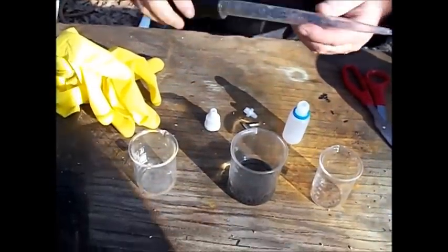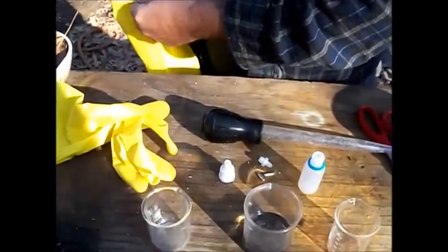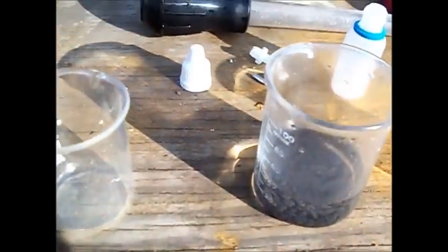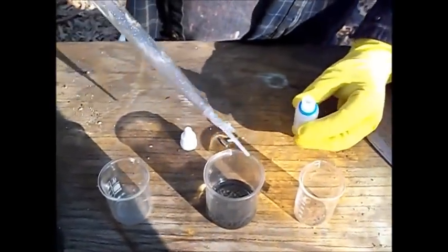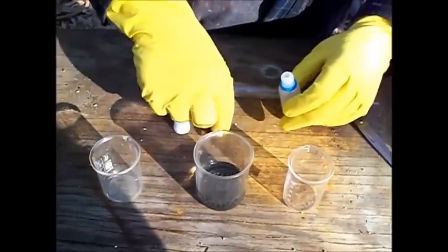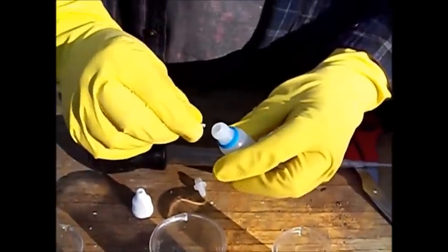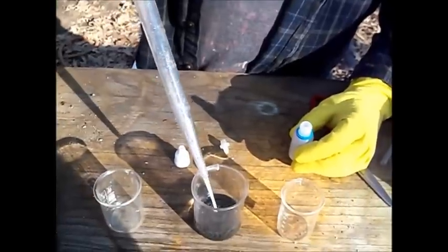Let me go ahead and get these gloves on before I get into moving this stuff around. Got to try to be as safety conscious as we can be. Also, it's always best to add a few pieces of solid metal in your bottle before you put the solution in — that keeps the solution viable longer.